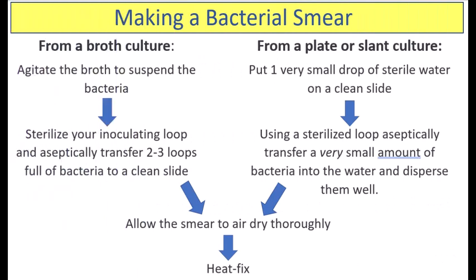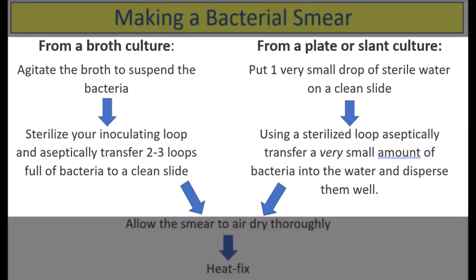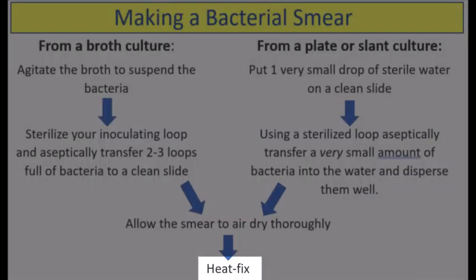In preparation for staining, a smear will need to be made first. Basically, what you're doing here is transferring bacteria to a slide, letting them dry, and then heat fixing them.